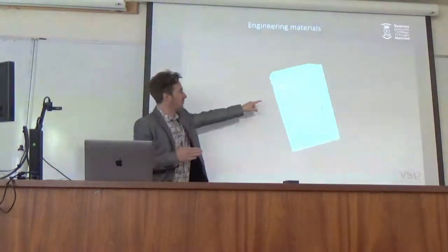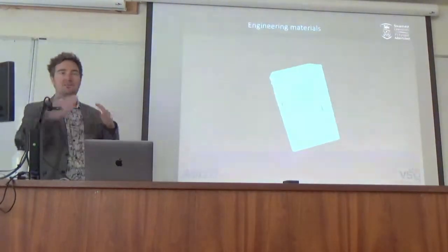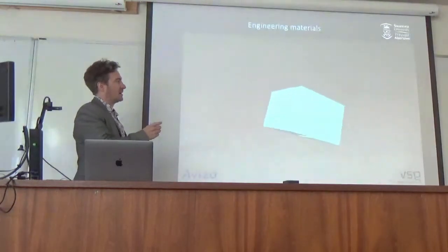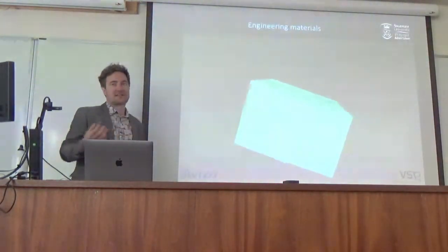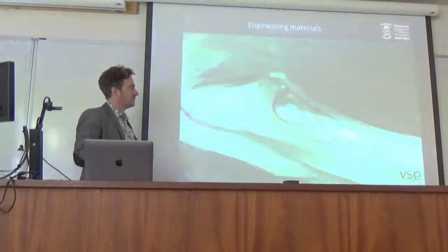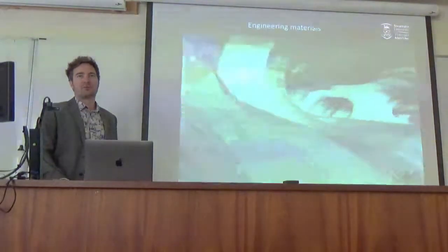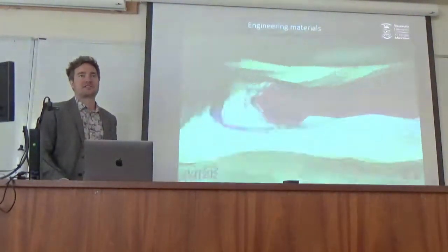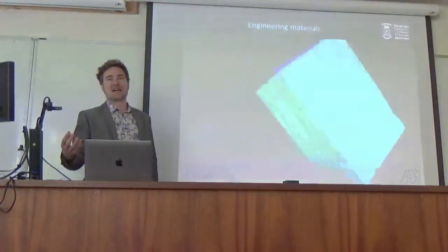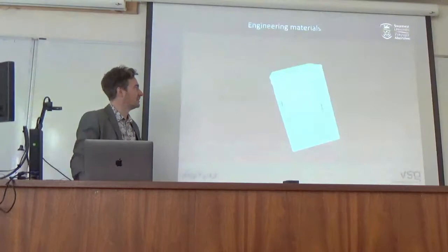If there are all of these small pores for the gas to pass through this material around the blades, then you lose efficiency. So trying to understand the interconnected porosity, or whether it's isolated porosity, is really important. This travel through helped to visualize that. We could just say there were two or three pores in this segment that passed through, but actually to travel through the porosity gave those engineers a greater understanding of the gas passing through at that point.